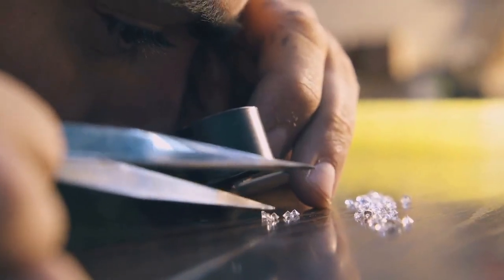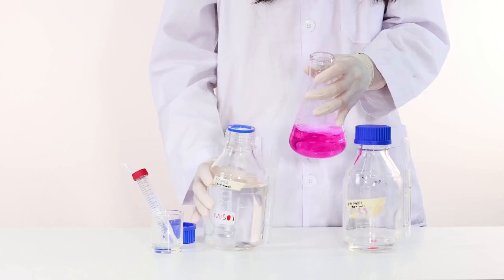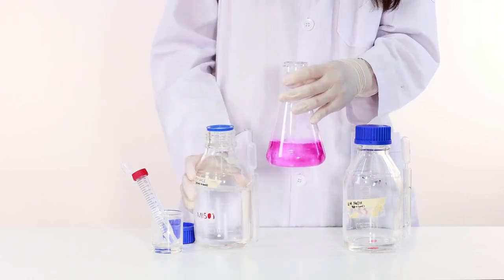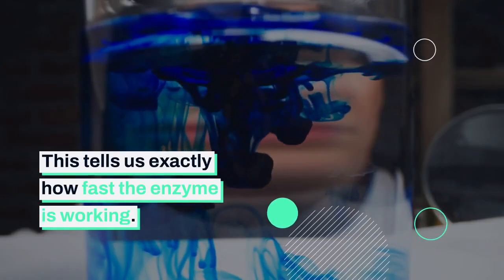Another key application is in studying enzyme kinetics, which is the speed of enzyme reactions. If an enzyme creates a colored product, we can put the reaction mix in the spectrophotometer and watch the absorbance increase over time. This tells us exactly how fast the enzyme is working.